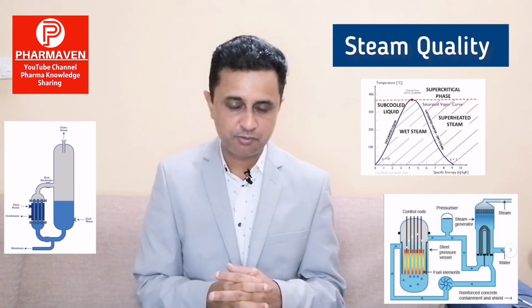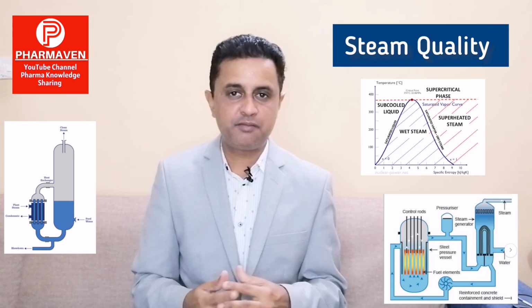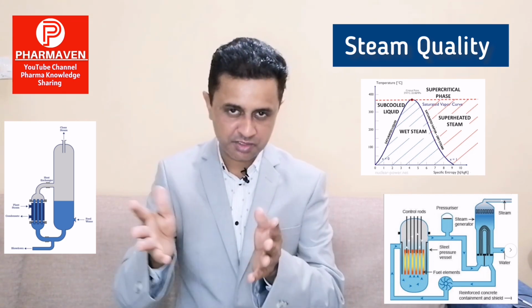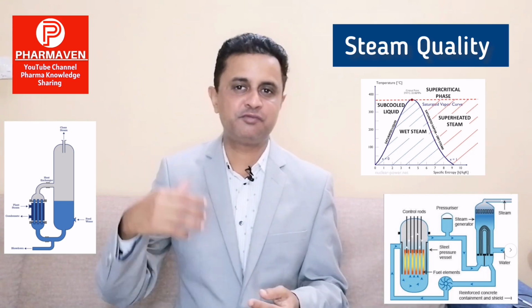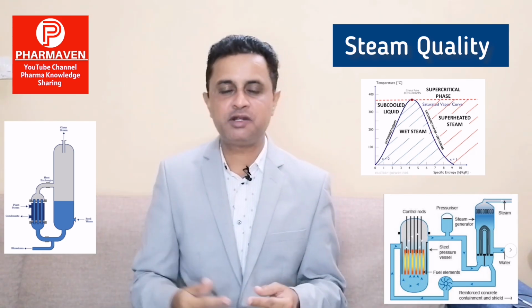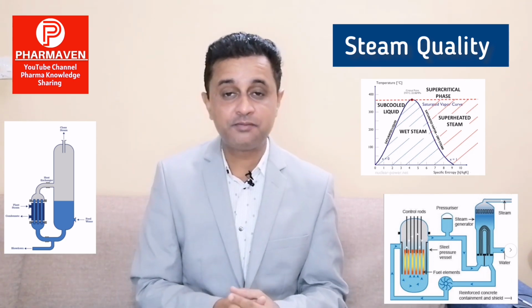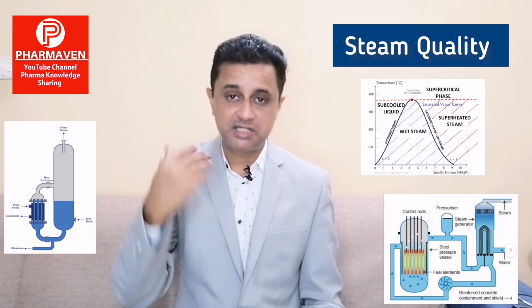Just check out the steam quality parameters. If we want, we can also check the parameters of the pure steam generator, whether there was any change or fluctuation on that specific date which might not have produced the required quality of steam, which might have a lot of condensate, a lot of non-condensable gases, or produced superheated steam. So these factors we can identify by checking the steam quality.